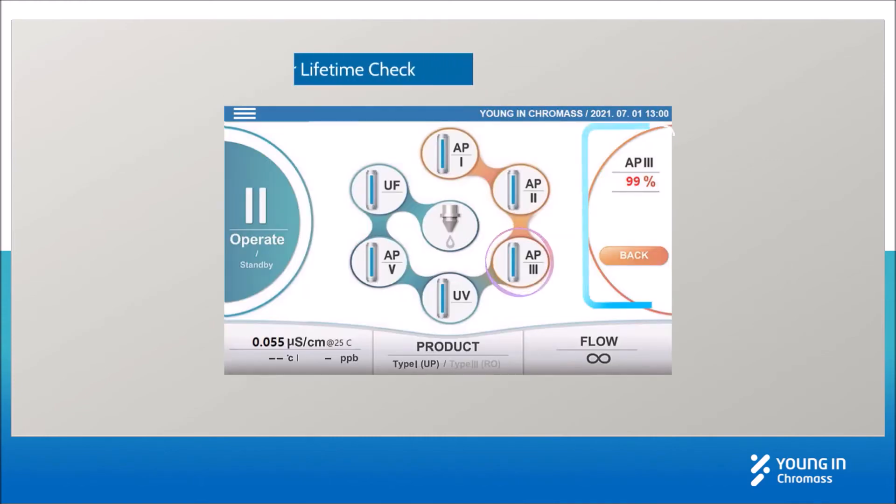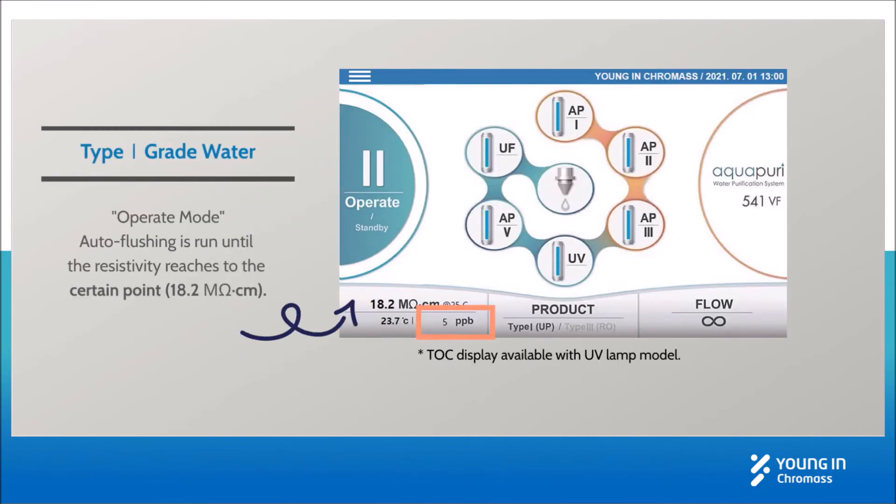You can check the lifetime of filters by clicking the filters. For Type 1 grade water, auto flushing runs until the resistivity reaches a certain set point. You can see it in conductivity as well.